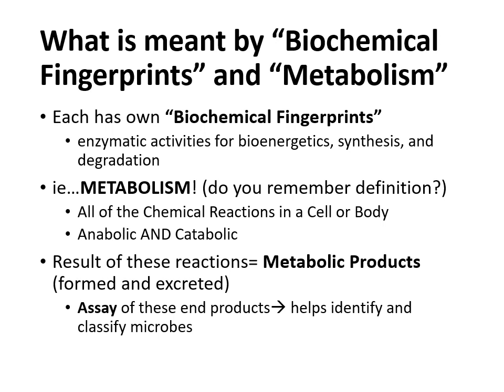Okay, so you've actually seen this already in the lab. For instance, when you saw MSA plates. When Staph aureus or Staph saprophyticus were present, ask yourself, what happened? Well, the red plate turned yellow because they were capable of enzymatic activities of breaking down the mannitol, right? And you were able to visualize that with differential media.